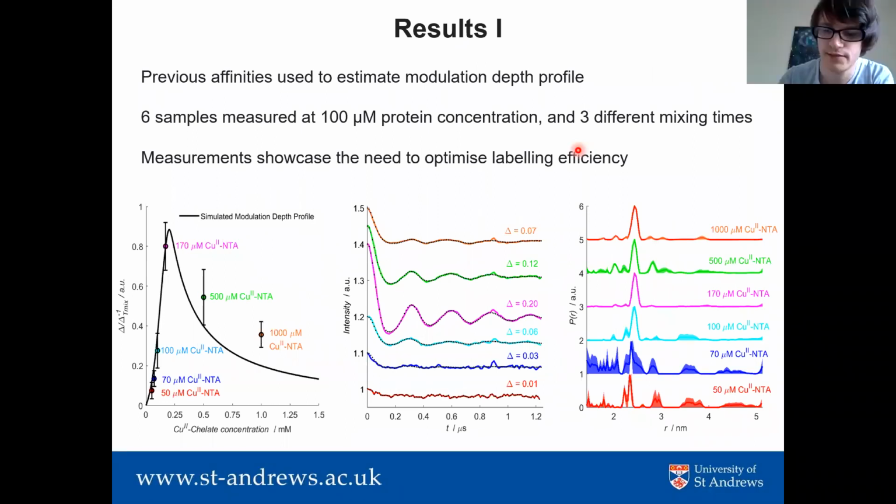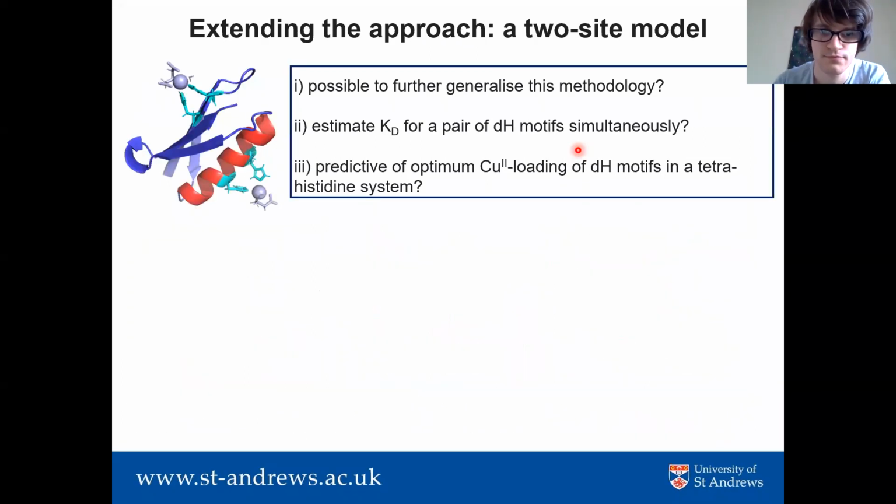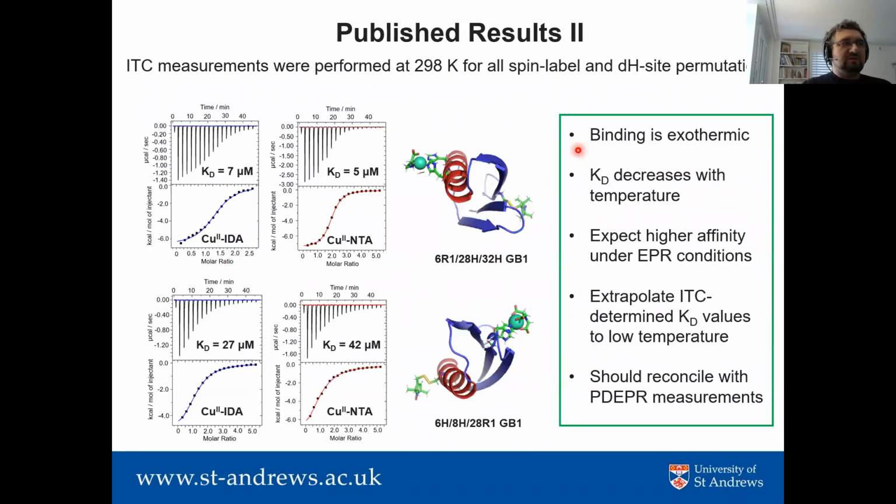Regarding this, can you comment a bit more extensively on what precautions one would need to use this labeling if it is compatible with, I don't know, nucleic acids? Where would you see any limitations that one should avoid or carefully check when using these copper NTA or IDA labels?